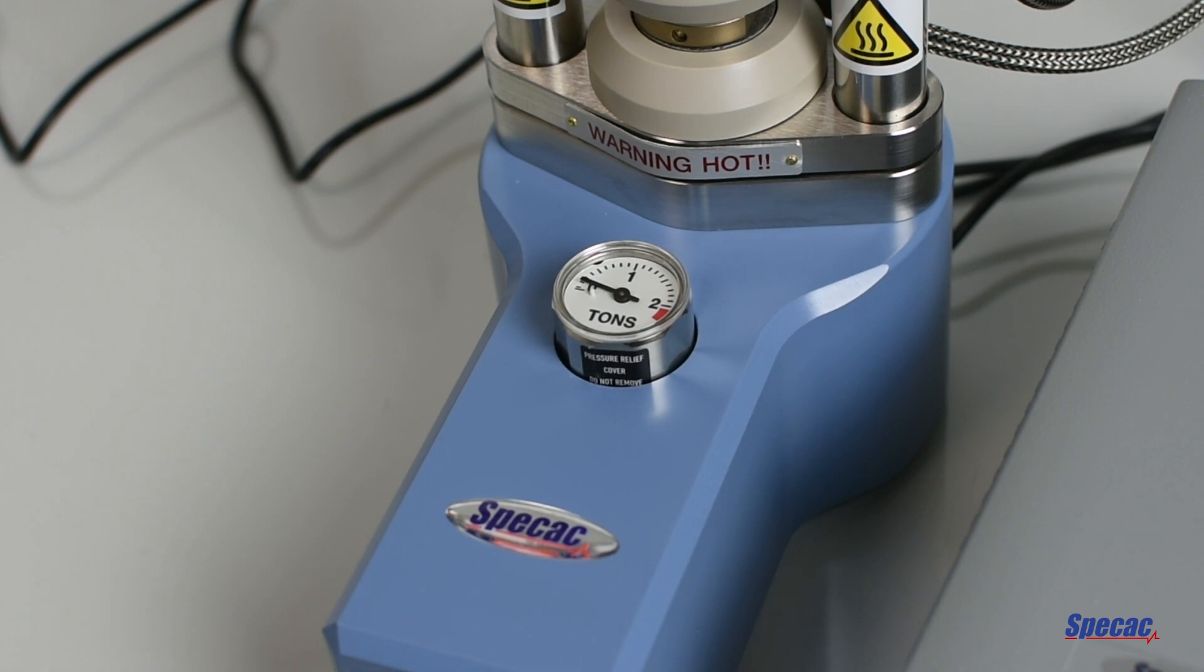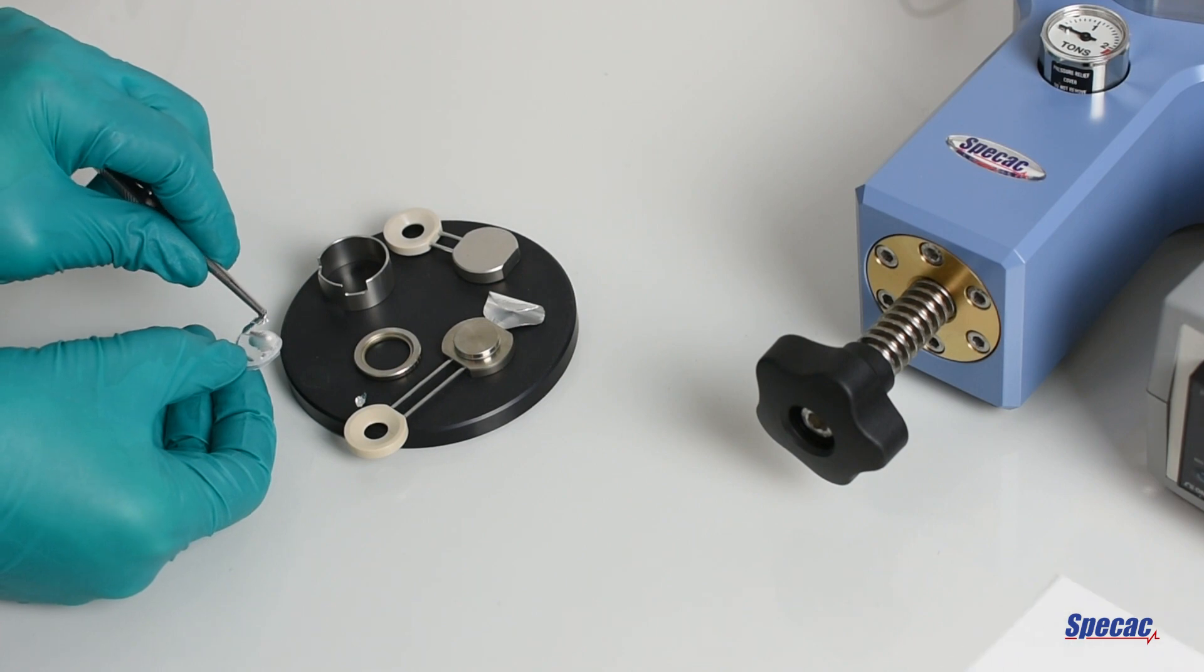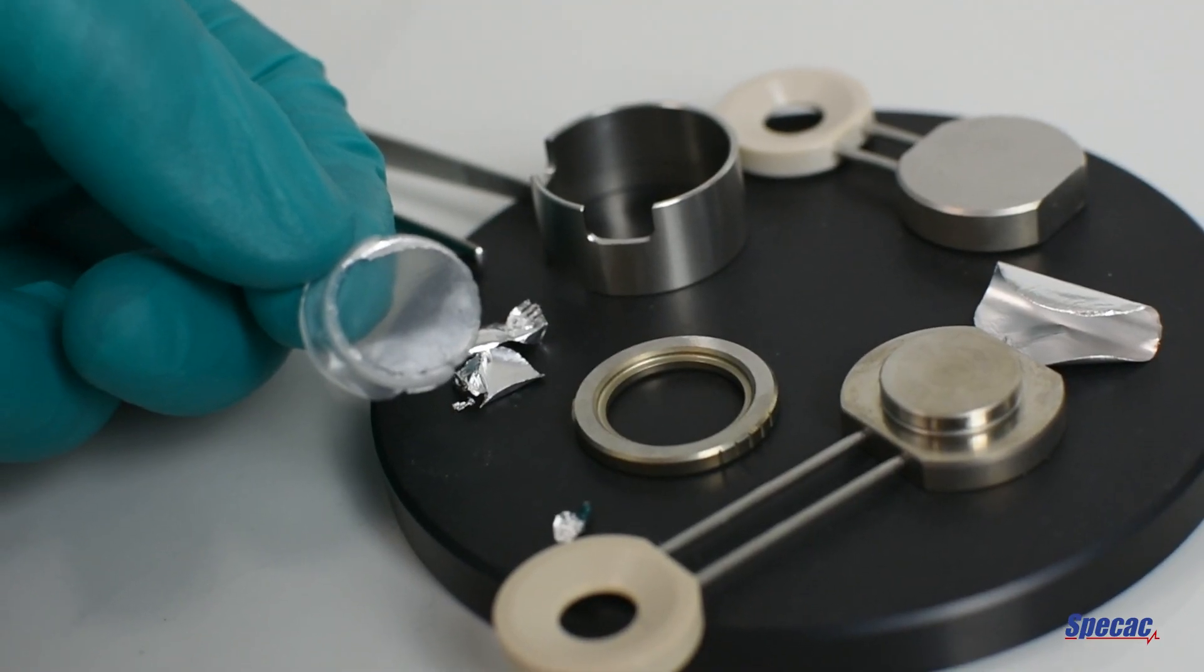This product video will show the production of a polymer thin film from a solid bead of low-density polyethylene which has a melting point of around 116 degrees centigrade.